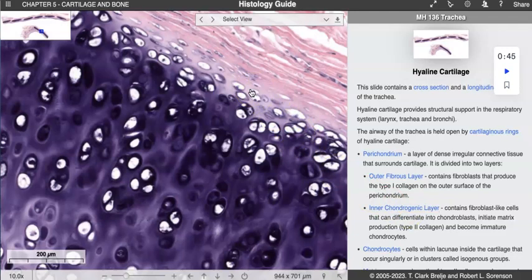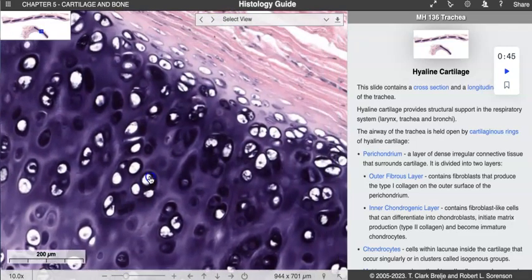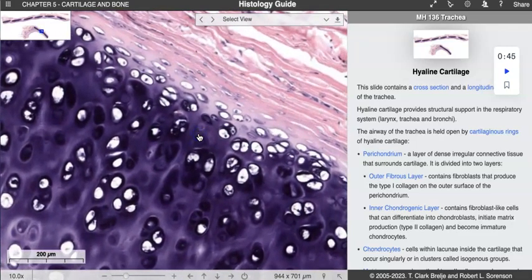Now, we have to remember that not all cartilage and bone surface has a membranous covering. Where there's going to be any sort of wear and tear, or two surfaces rubbing up next to each other, or really a mobile surface, we're not going to have a perichondrium or an outer bony layer like a periosteum, right? So this is not that case. This is the surface of the cartilage on both areas. This isn't a joint area. So we would find a perichondrium on both areas.